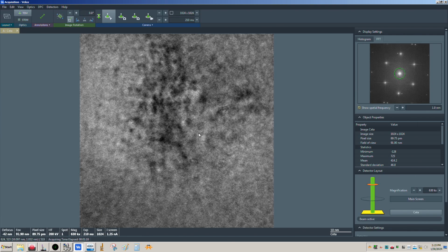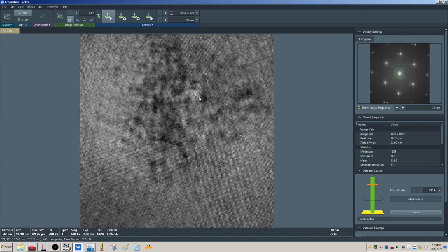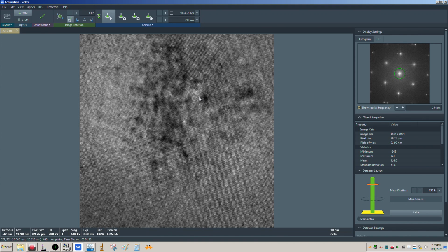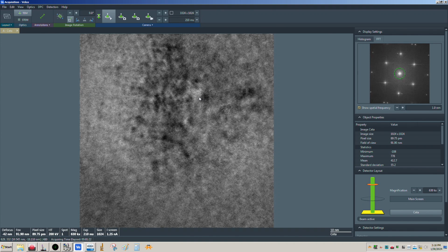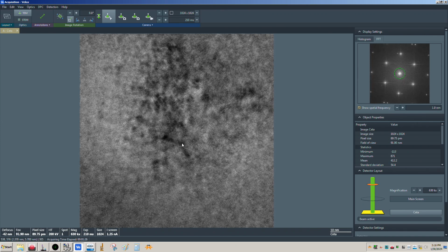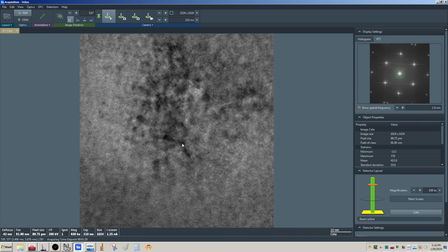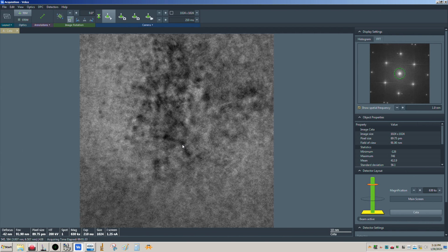So you have to be cognizant of this as you're working, right? And you have to look and see, okay, what's happening to my material, right? And I'm modifying it by what I'm doing right now. And chances are with time, you probably will be doing that, okay? I mean, we can see very clearly now we've created a nice gash here on the sample, if you will.